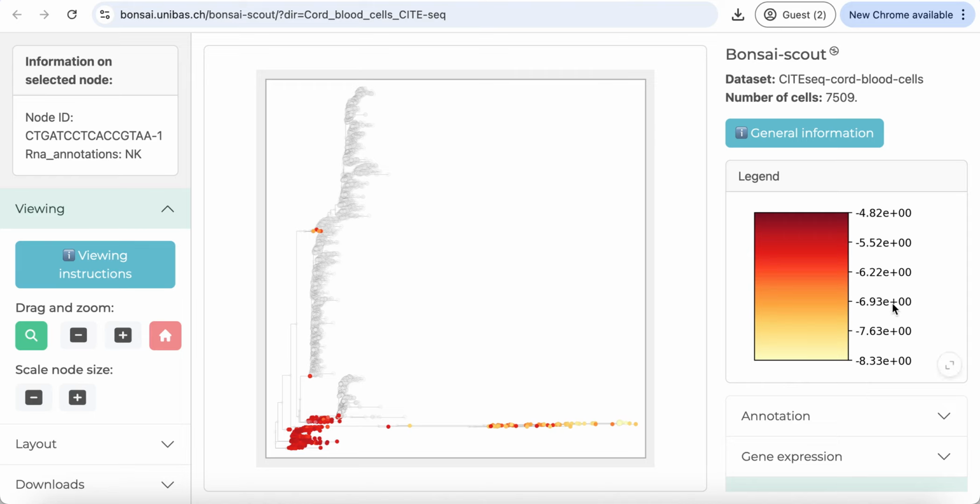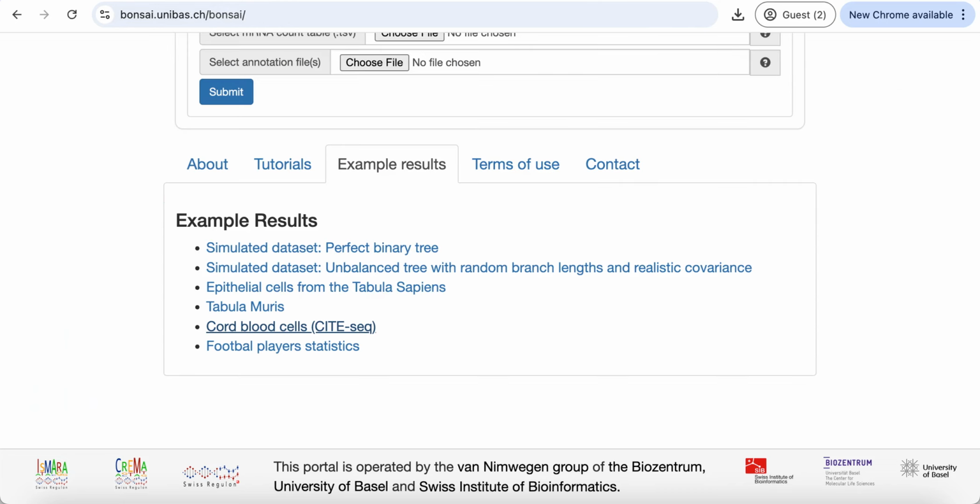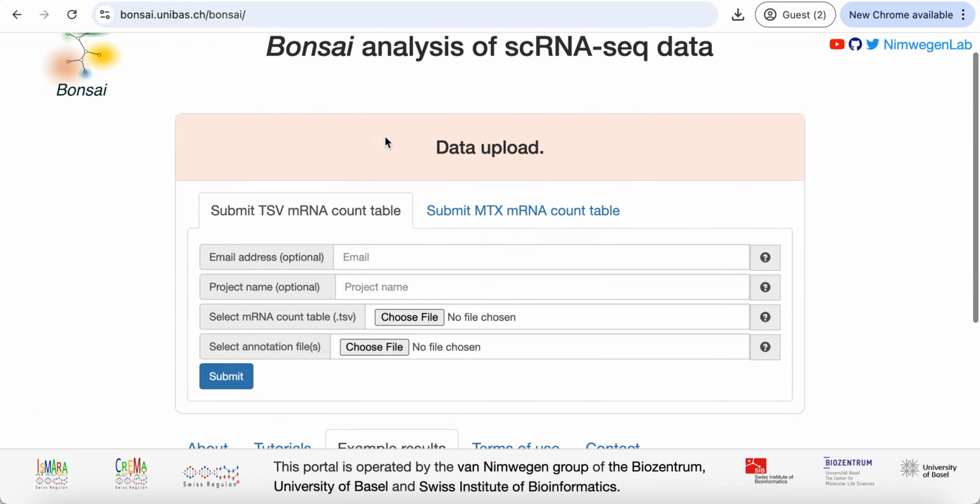Thanks for listening, and if you want to run Bonsai on your own data, we also have a video on that, because you can use our Bonsai-scout server here to upload your own mRNA count table, and then we will run all the analyses, and you will get a link to the Bonsai-scout app where you can then explore your data.